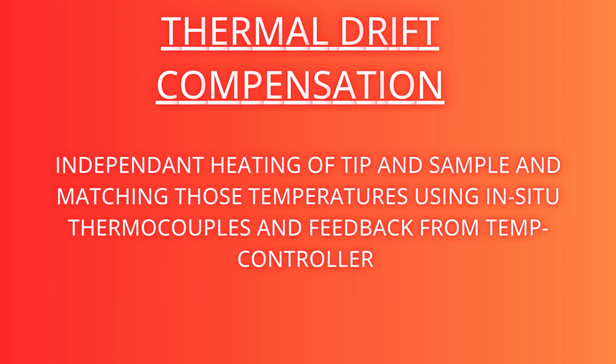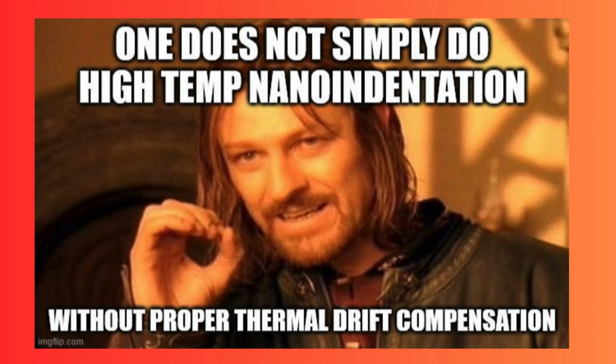Also, we can use in situ thermocouples and the feedback from the temperature controller to keep it adjusted throughout the entire measurement. So, doing so, we get a more stable contact point and reliable displacement measurements even at high temperatures.